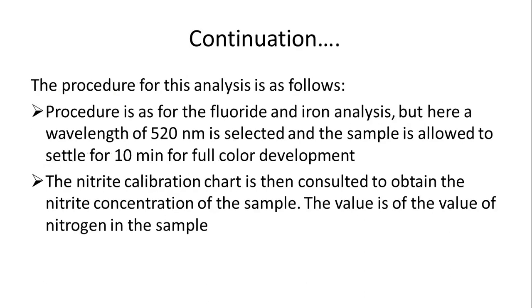The procedure for that is the same. We'll start by taking our sample, measuring out 10 ml and pouring it into the cuvette to the mark, and then adding.